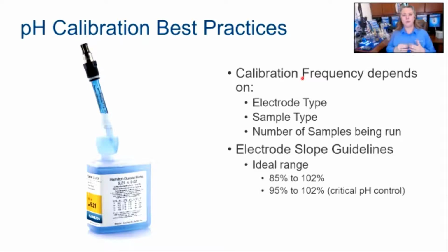So many companies will have a process that best practices suggest that every X number of times you take a measurement, you do a validation or a verification. If it passes, you can do that many measurements again. If it fails, you clean, calibrate, and do it again. And you should keep the log of every time it changes.